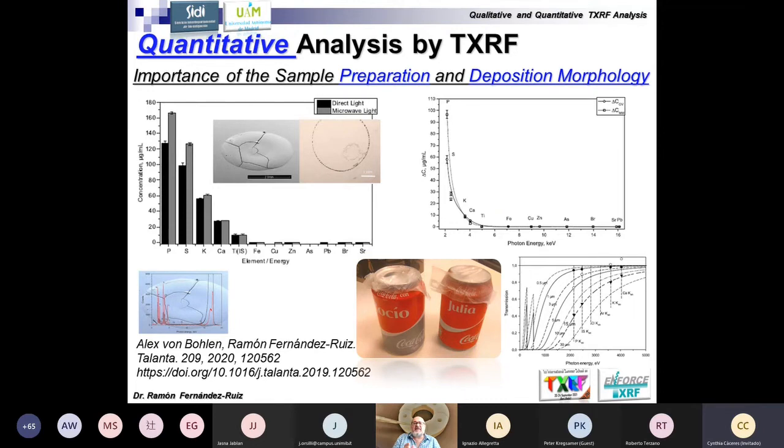No problem, an internal standard addition. Good. We are going to check in a direct way, and with time you can see this microscopical morphology. It's really a crust of sugar, of saccharose in particular. But this has implications. With time, you can see the concentration results for this sample with this crust.